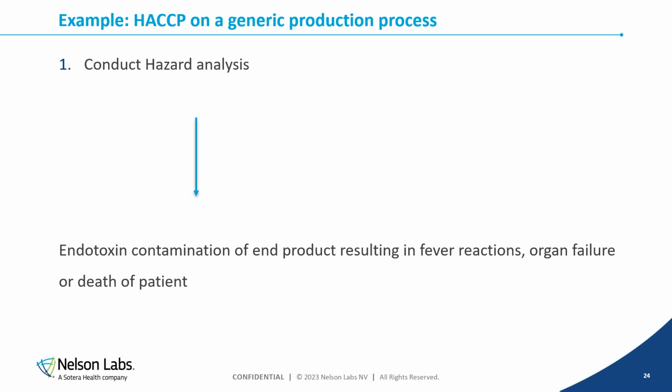You can use the same principles of HACCP for aseptic manufacturing, but then of course the hazard is a non-sterile sample and not endotoxin concentration. And that's important to understand, and I'll show you in a minute why this is so important.